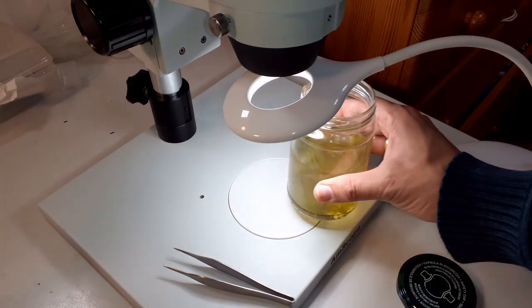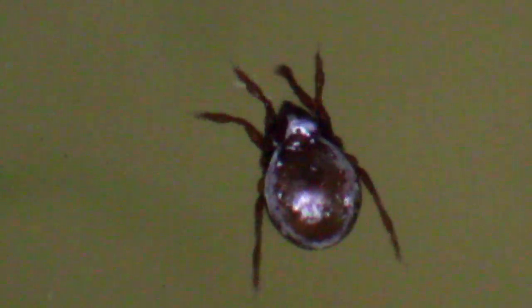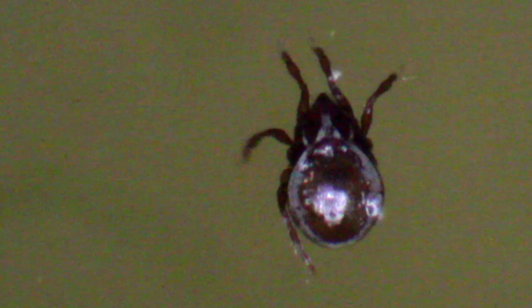Well, actually it was quite easy. All I did is put the glass with water directly under my stereo microscope and then I immediately saw the mites — quite a lot of them. They look pretty big but the magnification is quite large. This is a little bit of time lapse because they were moving so slowly, and the strings that you see are the algae. One of the mites was actually stuck on the surface of the water because of the surface tension — it couldn't get down.